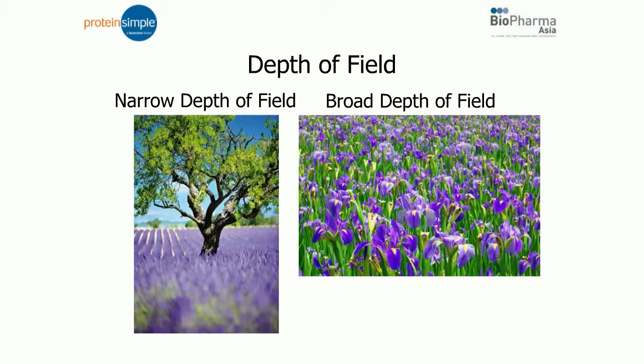Now, if you compare the two pictures, perhaps you might say the picture on the left is the better picture. It's a prettier picture. It's more artistic. But if your goal is to compare all of the flowers in the picture, and I would draw a parallel between that and particle analysis, if your goal is to compare all the flowers in the picture, it's far easier to compare the flowers in the right picture than it is in the left picture.